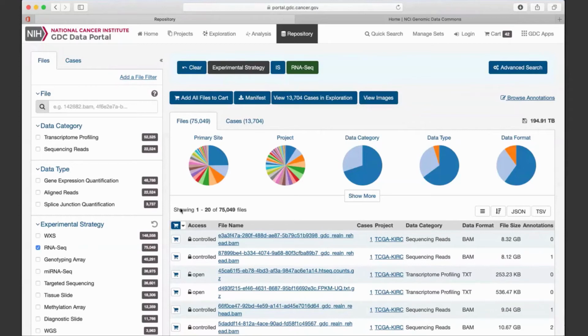So the number of variant callings depends on the tumor aliquots. If your patient has 3 or 5 different tumor aliquots with DNA-Seq BAMs, all of those will be called, and eventually we will generate the same number of aliquot-level MAFs.